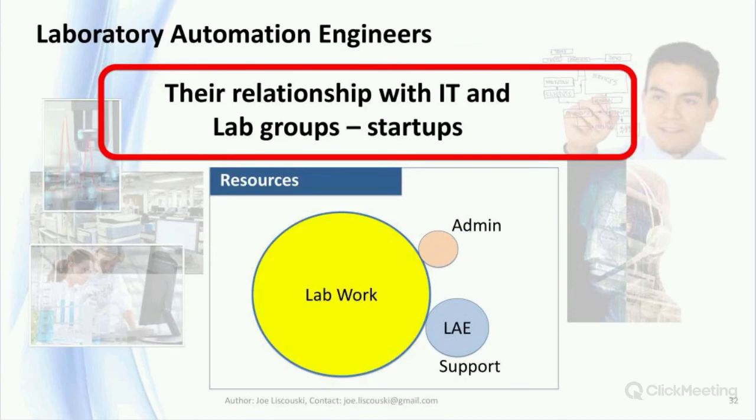Vendor-supported SaaS informatics would relieve a lot of the traditional IT burden and allow them to concentrate on systems that support lab work. Office systems and infrastructure at this stage would require little active support as long as the equipment, both hardware and software, came from reliable vendors and was familiar to those working there. If the organization chooses to outsource its IT support, they should be able to evaluate the organization's ability to meet the criteria noted in the previous slides.